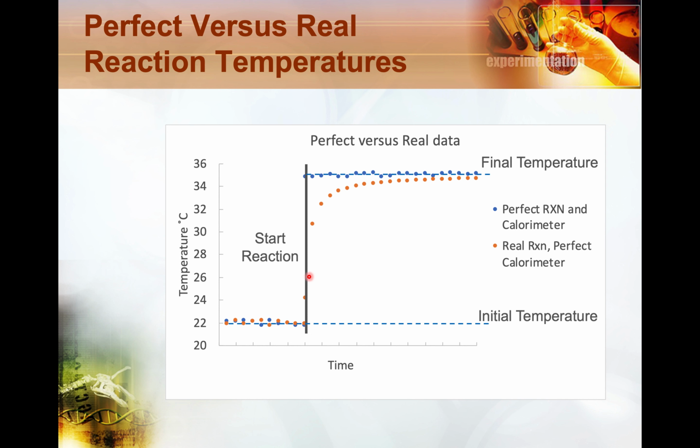The other thing to note as well is that the reaction does not occur instantly. It will take time, and the temperature will rise over the course of the reaction, and eventually it should get towards the temperature that you need, but it won't be instantly. So you need to monitor for a while and wait for that temperature to normalize.